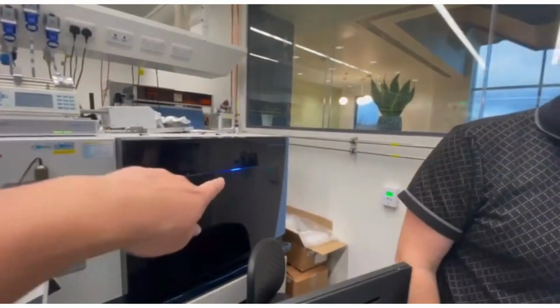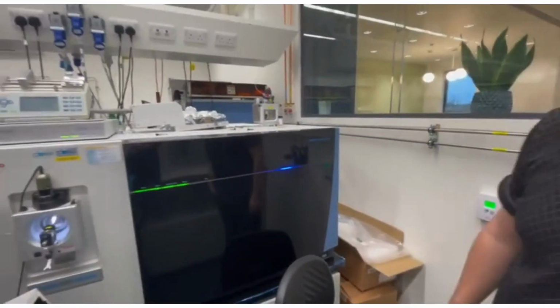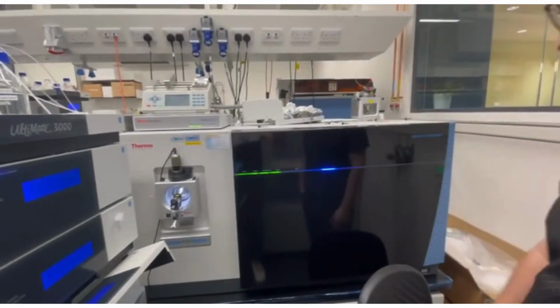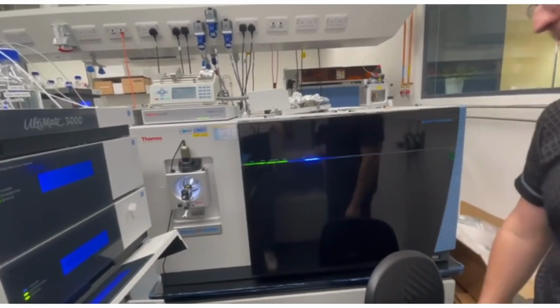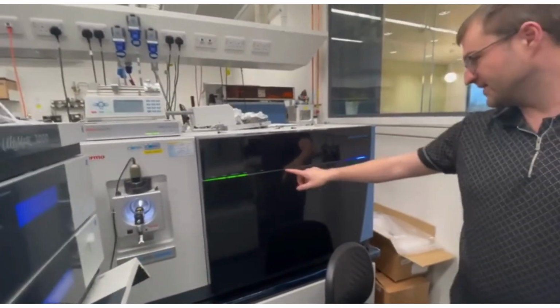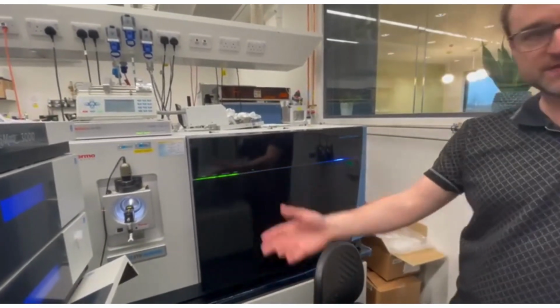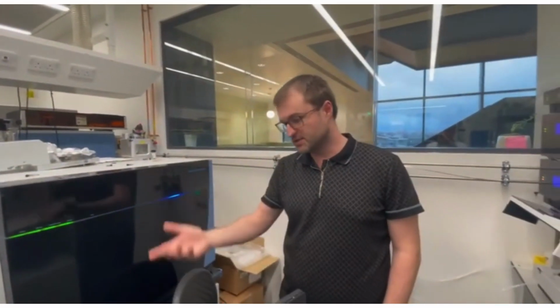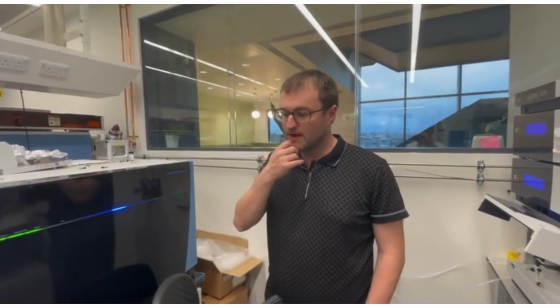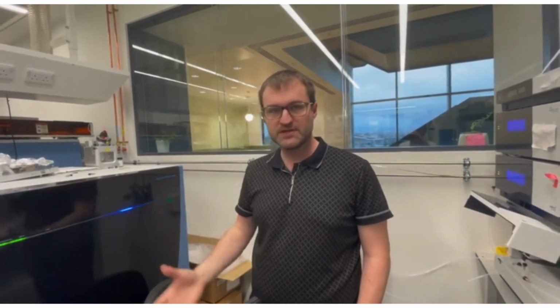And this line represents how molecules are running? No, exactly. Well, yeah, no. This is an aesthetic choice by the company to illustrate that it's actually acquiring data right now. So right now we have some samples here. Just to give you an example of what we measure, our collaborators are interested in a particular complex and how it assembles on the DNA.